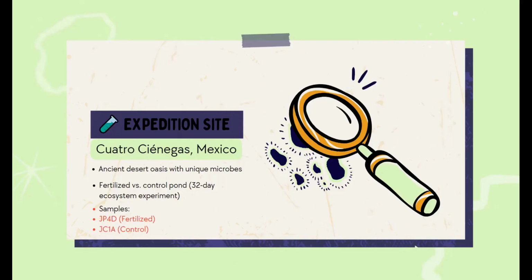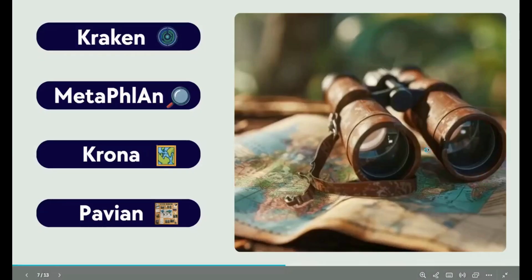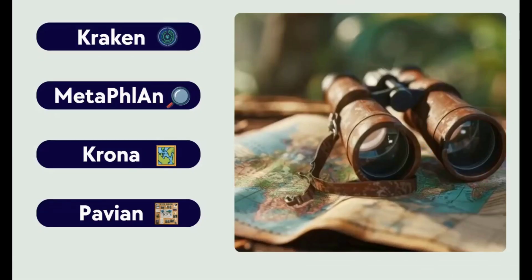So now we are ready to start our scanning journey. In this journey through the mysterious microbial forest, these tools in front of your eyes are the essential tools we will put in our backpack. Each one has a special job to help us find, count, and understand the tiny creatures hiding in our samples. Let's get started with these tools.